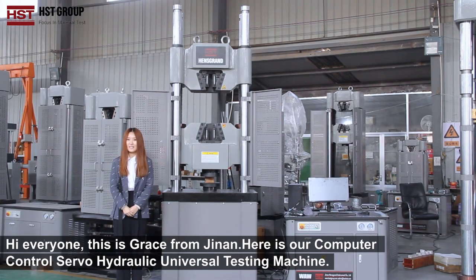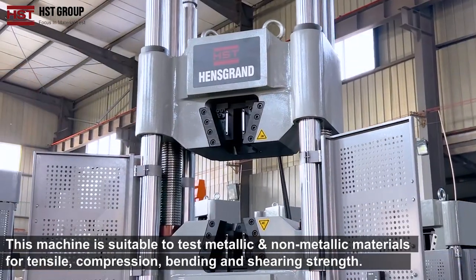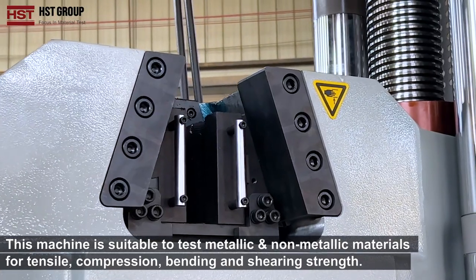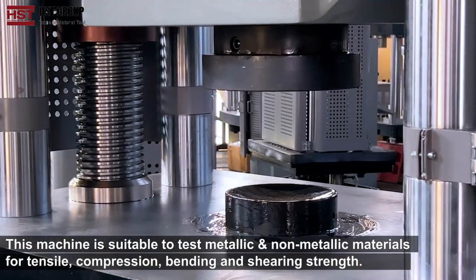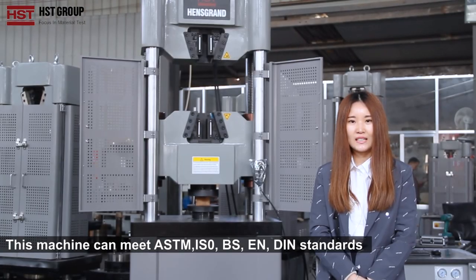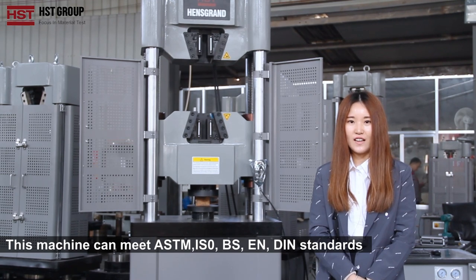Hi everyone, this is Grace from Jinan. Here is our computer-controlled servo-hydraulic universal testing machine. This machine is suitable to test metallic and non-metallic materials for tension, compression, shearing, and bending tests. This machine can meet the ASTM, ISO, BS, EN, and DIN standards.